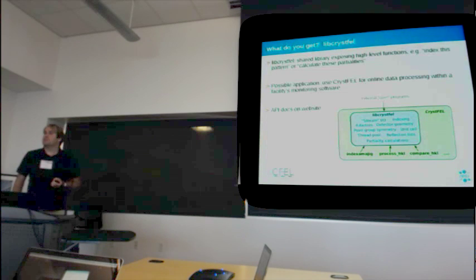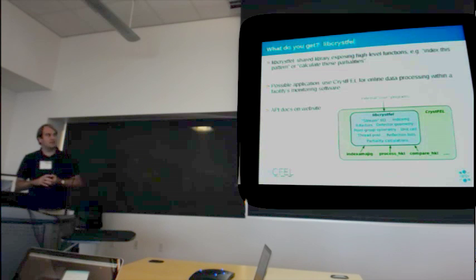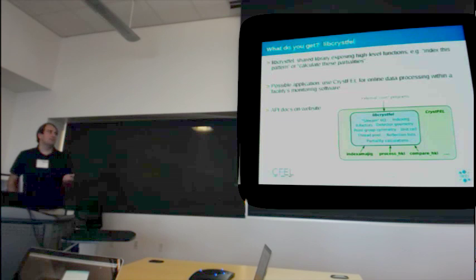Documentation is really the API on the website. External programs can use this library as well, and there are some core programs that also call this library within CrystFEL. We just draw this boundary of what we call CrystFEL and what we call external.